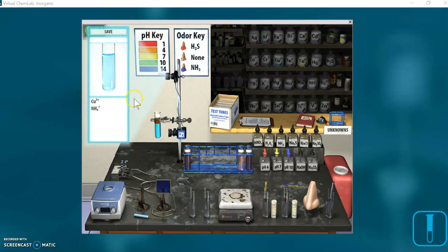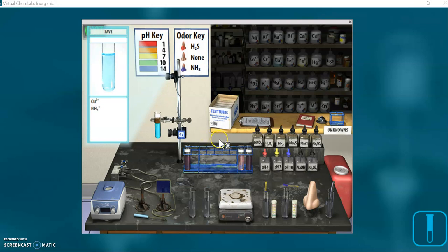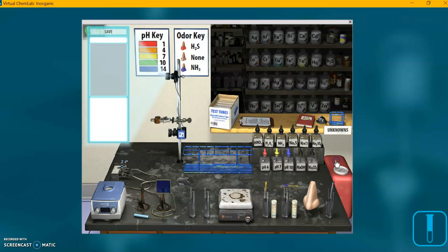We are done with this part of the lab — the known section. We have ways to separate out and confirm all these ions. Now we're going to do a practice unknown, which would be step eight on your worksheet. First, I'm going to clear out this lab — just clicking on the red can clears everything away.